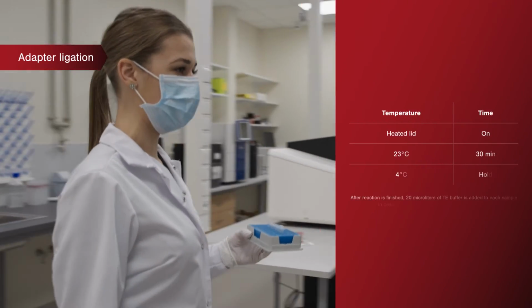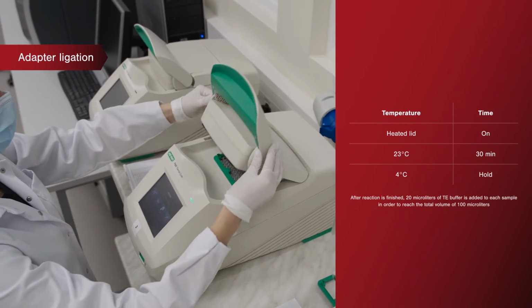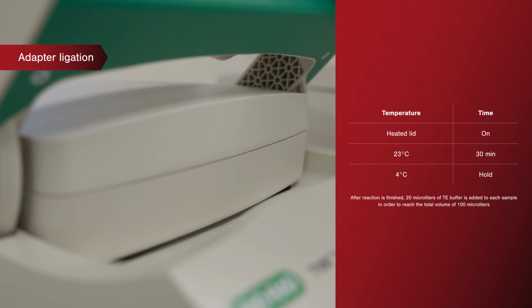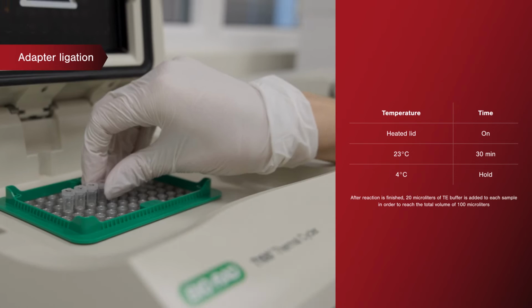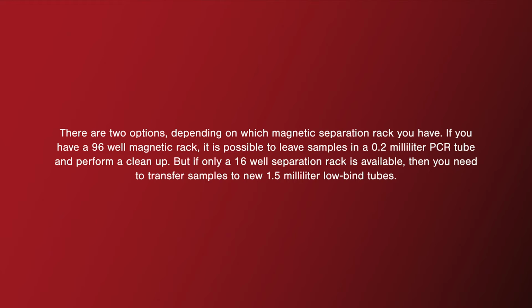Samples are placed in a thermal cycler in the following conditions. There are two options depending on which magnetic separation rack you have. If you have a 96 well magnetic rack, it is possible to leave samples in a 0.2 ml PCR tube and perform a cleanup. But if only a 16 well separation rack is available, then you need to transfer samples to new 1.5 ml low bind tubes.